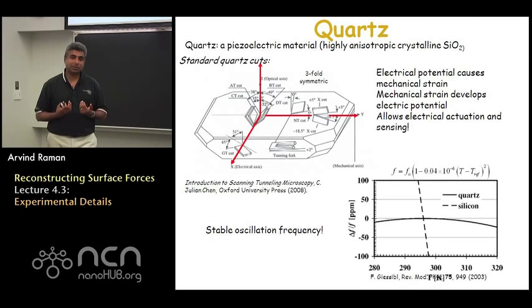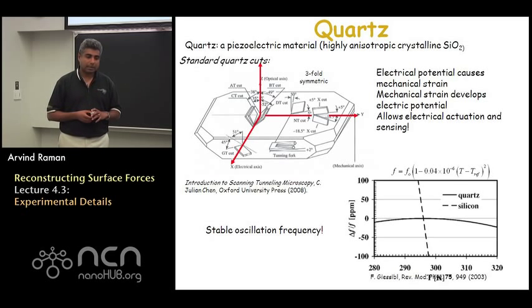It is probably useful to step back and talk a little bit about quartz. What is it? The piezoelectric properties of quartz have been known for more than a century now. It is a piezoelectric material, but a highly anisotropic piezoelectric material, and there are many planes of symmetry. Some of you may know how in elastic materials you could have anisotropies in different directions with different elastic constants. In the case of piezoelectric materials, you've got an electric response and you've got a mechanical response, and so the symmetry groups of piezoelectric materials can become considerably more complicated.